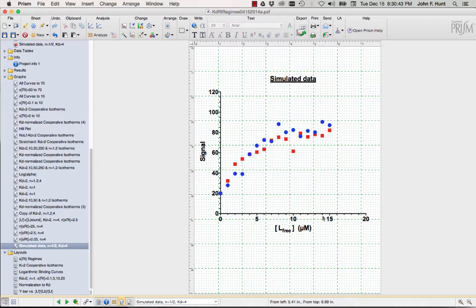I used the simulated data so that I could illustrate some points that I want you to pick up. And it would have been harder for me to do that with actual experimental data, especially the high quality data that we try to get before we publish something. In any event, these data, again, they're not awful. They are typical of the binding data that many people would publish.